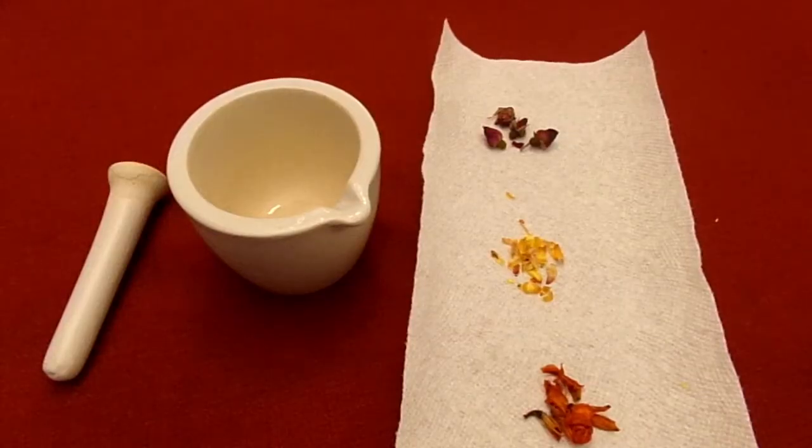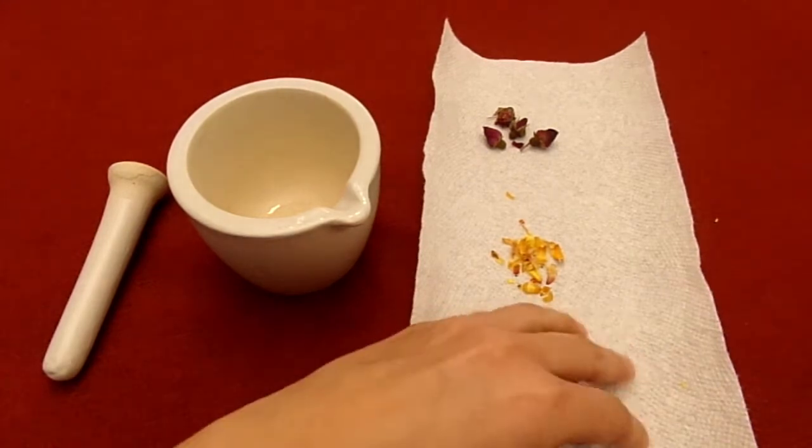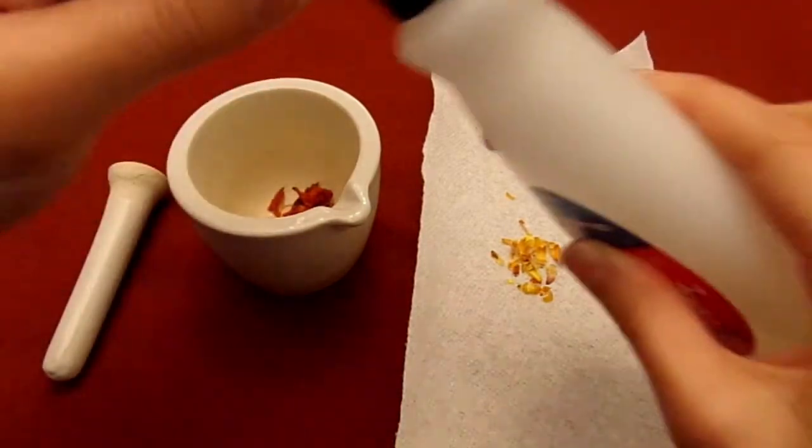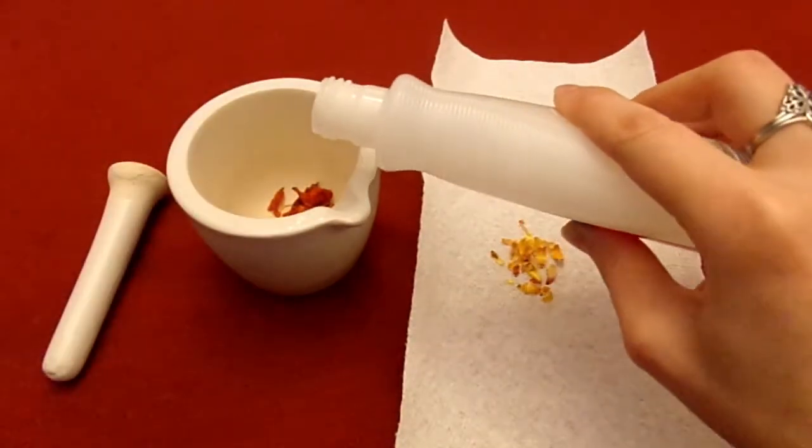Once you've separated your three types of flowers, take all of one type of flower and put it into the mortar. Then add some acetone. Add just enough to cover the tops of the flowers.